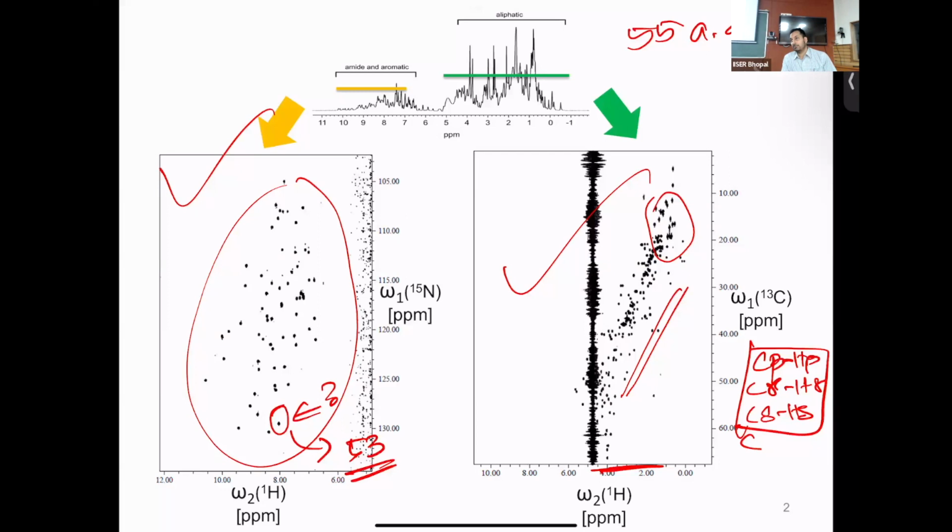That's about it. Let me stop this lecture here. Tomorrow's lecture will be on how to get the tertiary structure of the protein. Currently, what we have done is treat it as a polymer. You can get chemical shifts and say where the changes happen. But one of the important things is to say whether it's an alpha helix, a beta sheet or a loop. That's very important information, and how we get it will be the next question. I'm sad that I kept it to the last part of this course, but that's an experiment called nuclear Overhauser effect spectroscopy, which gives you approximate distances. That's what we will see for the next 2 classes.